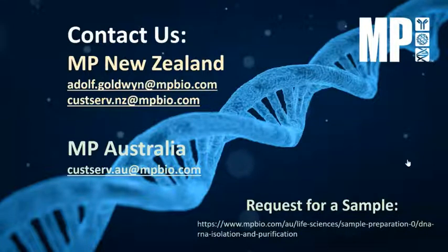In this situation, when we look at yield, sometimes with the manual process we are able to control the process, and also you're handling the samples one by one. I think that will actually help to improve the yield and also get more specific on the extraction process. Of course, we can trust automation to give us consistency in processing a large number of samples. This is one of the challenges people face with large numbers of samples: achieving consistency and still accuracy. So it is a balance between the number of samples you are dealing with and the consistency and accuracy you can get. I hope that answers your question.